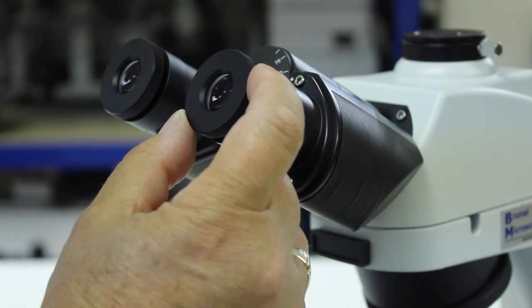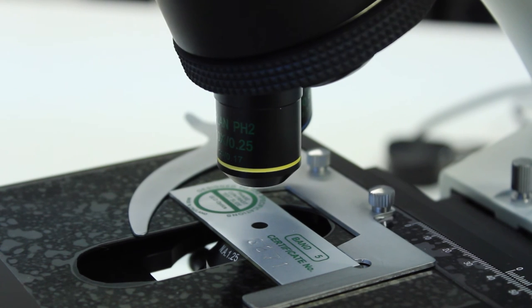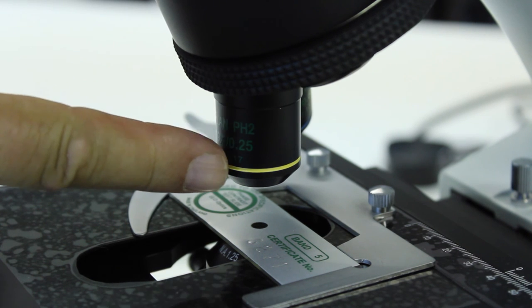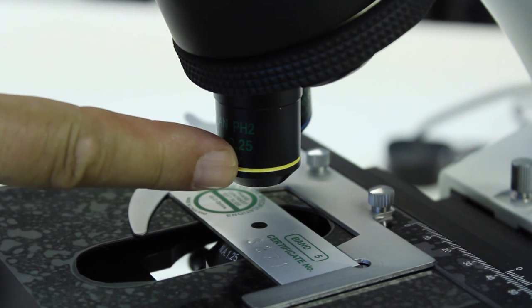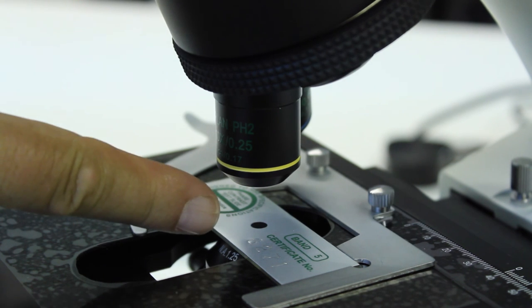Asbestos fiber counting uses the times 40 phase contrast objective, but we're using the times 10 with the yellow band here just as a mechanism for more easily finding the lines on this test slide.